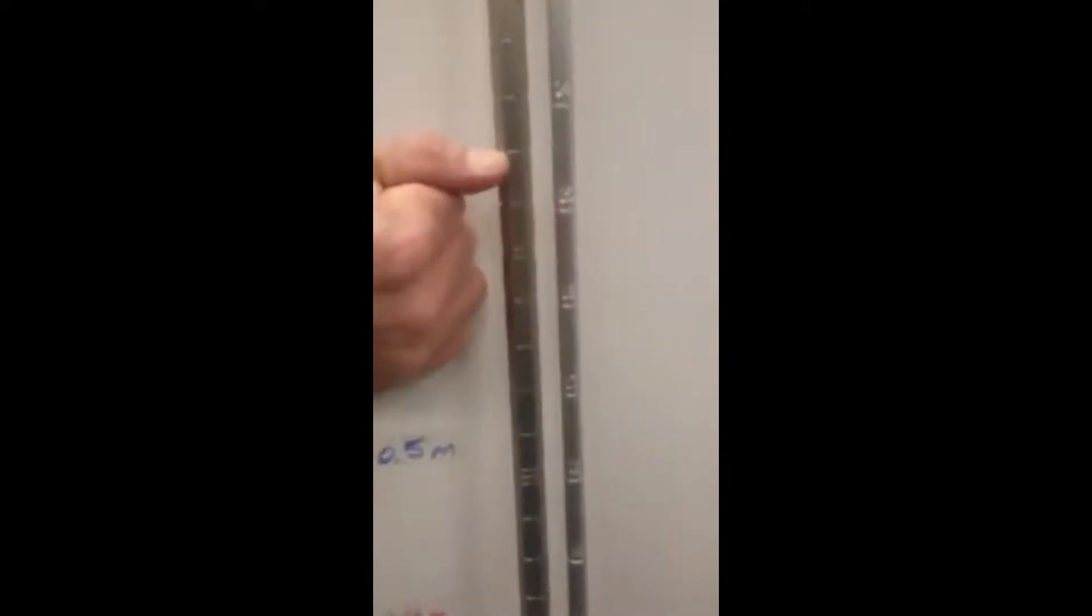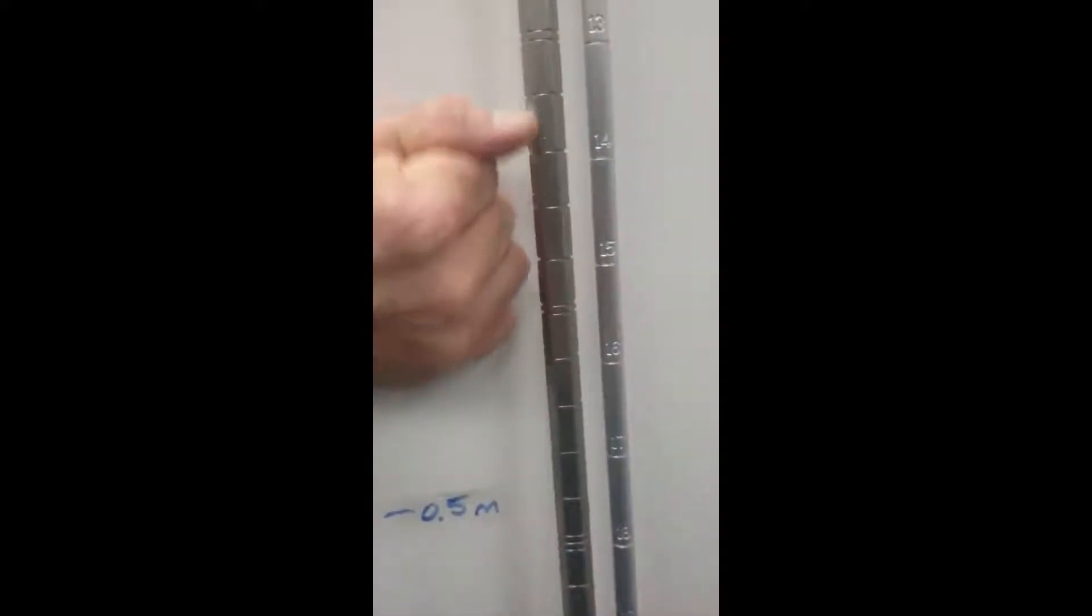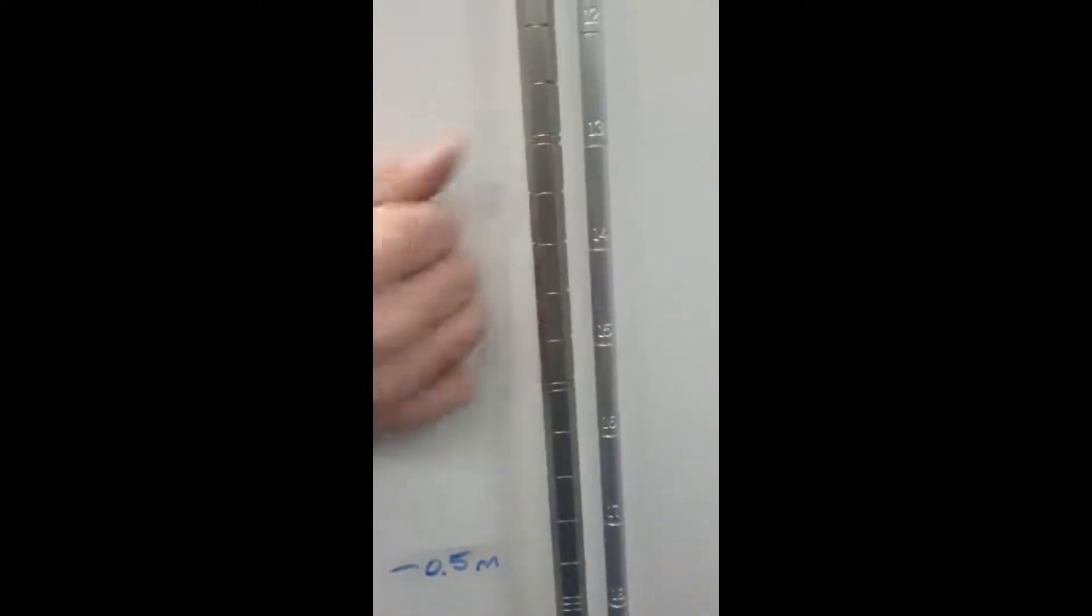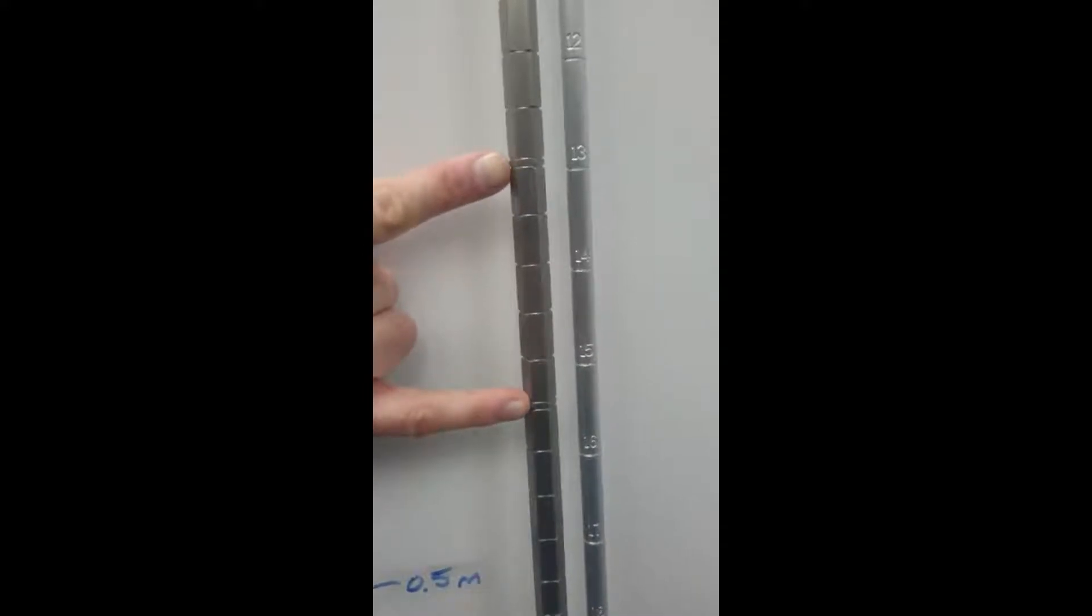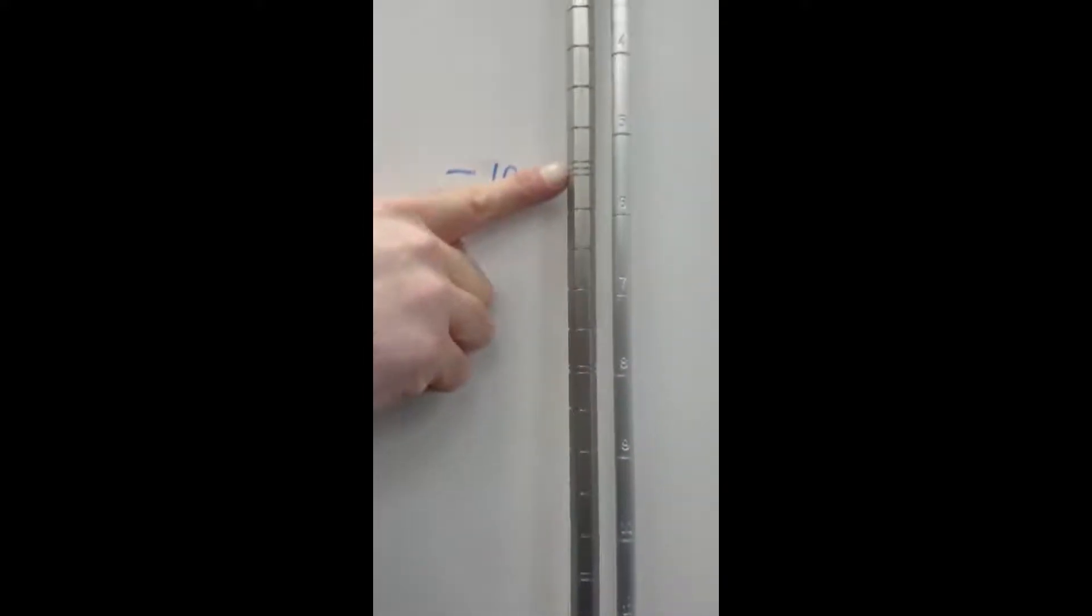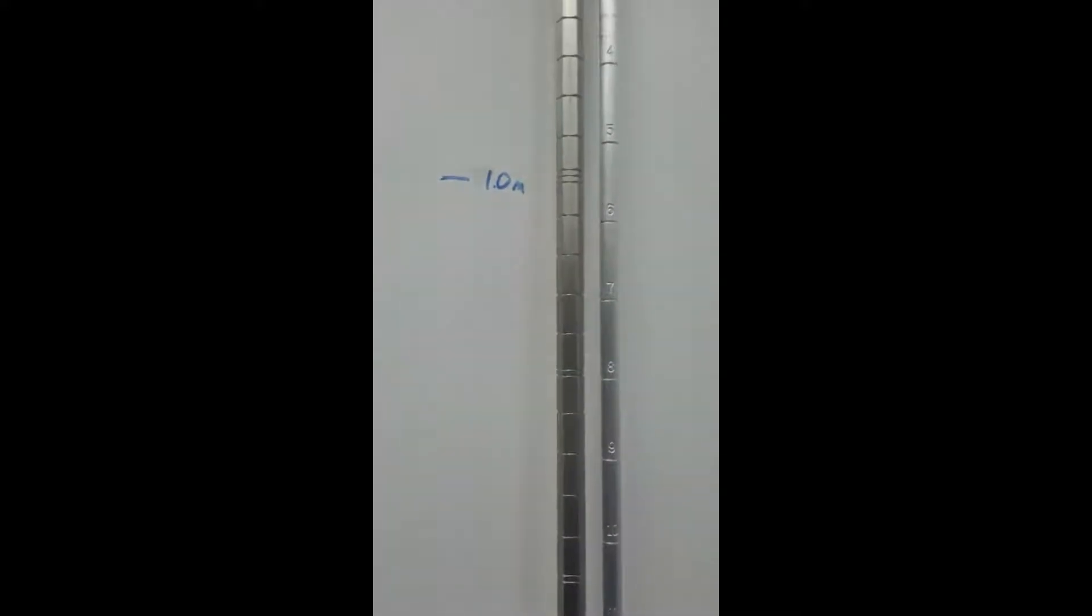So individual marks, that'll be a two centimeter gap - two centimeters, two centimeters. And then when it's double it represents 10 centimeter intervals. So that's 10 centimeters, 10 centimeters. And we go all the way up and we have a triple at 50 centimeters and 100 centimeters.